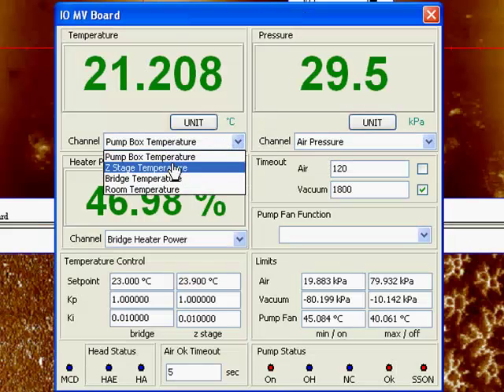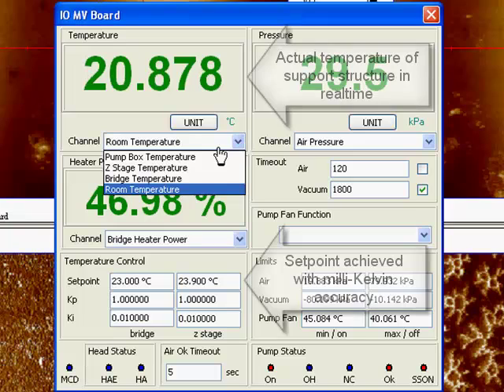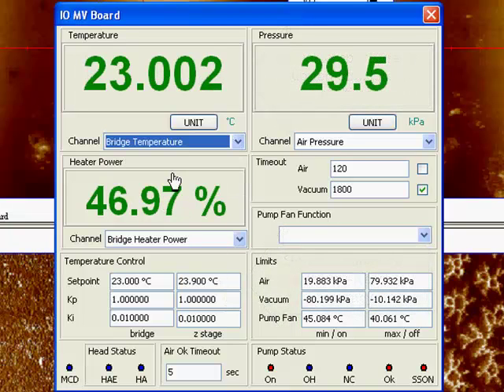One way we achieve the high stability of the system — which already allows you to take the first image immediately — is that we heat the actual support structure. As you can see, we measure the structure and then bring it up to a user-selected set point, typically two degrees above room temperature. This is one of the reasons why the system is so stable.